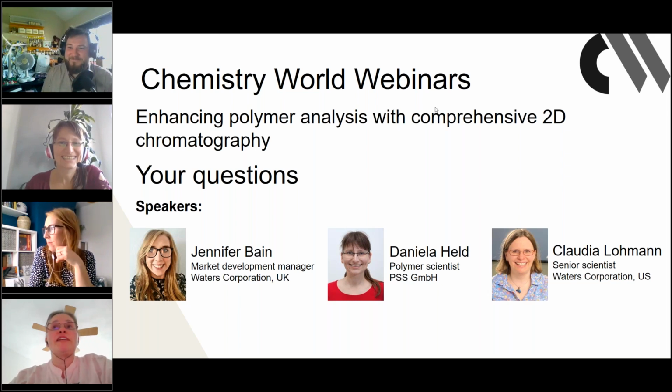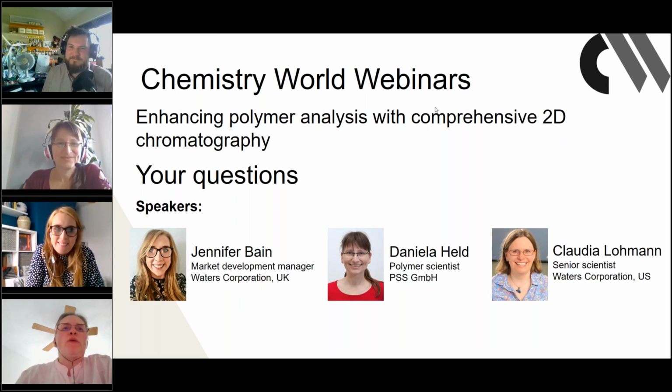I'm inclined to say always yes, but you always have to do some method development upfront to see what you see eventually. Based on the expected molecular weight range of the compounds, I'm always inclined to say yes.